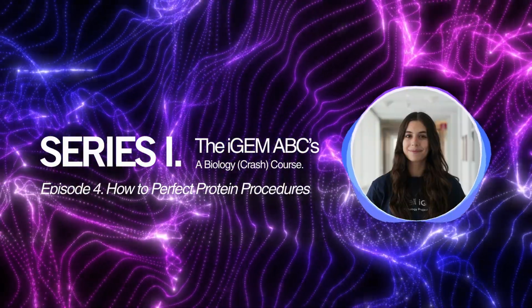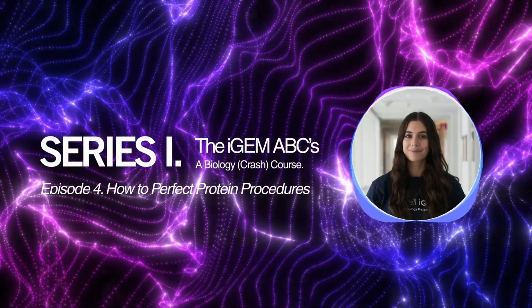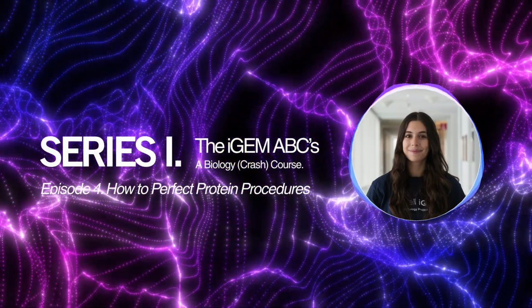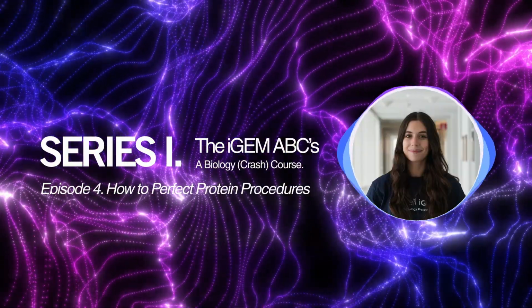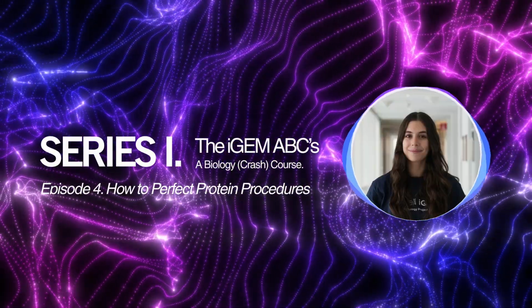This process is a little bit tricky because it doesn't distinguish between similarly charged proteins. So in your lysate, you'll expect to have a lot of bacterial proteins that are positively charged or negatively charged. And so it can be challenging to put an enormous mixture of proteins like your initial crude or clarified lysate through the column, because many proteins will be retained and they'll contaminate your product.